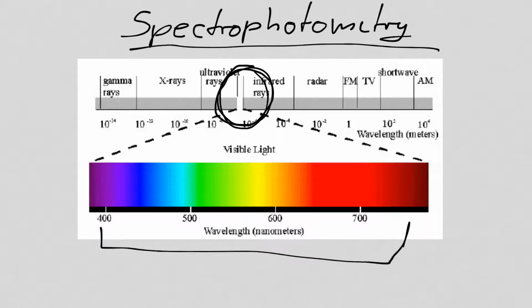There is also something called infrared spectroscopy and also UV spectroscopy. And you have used a little bit of UV spectroscopy already when you measured the concentration of this protein solution of BSA. And why this works, I will come back to in a minute. So how do these things actually work? What's going on there?